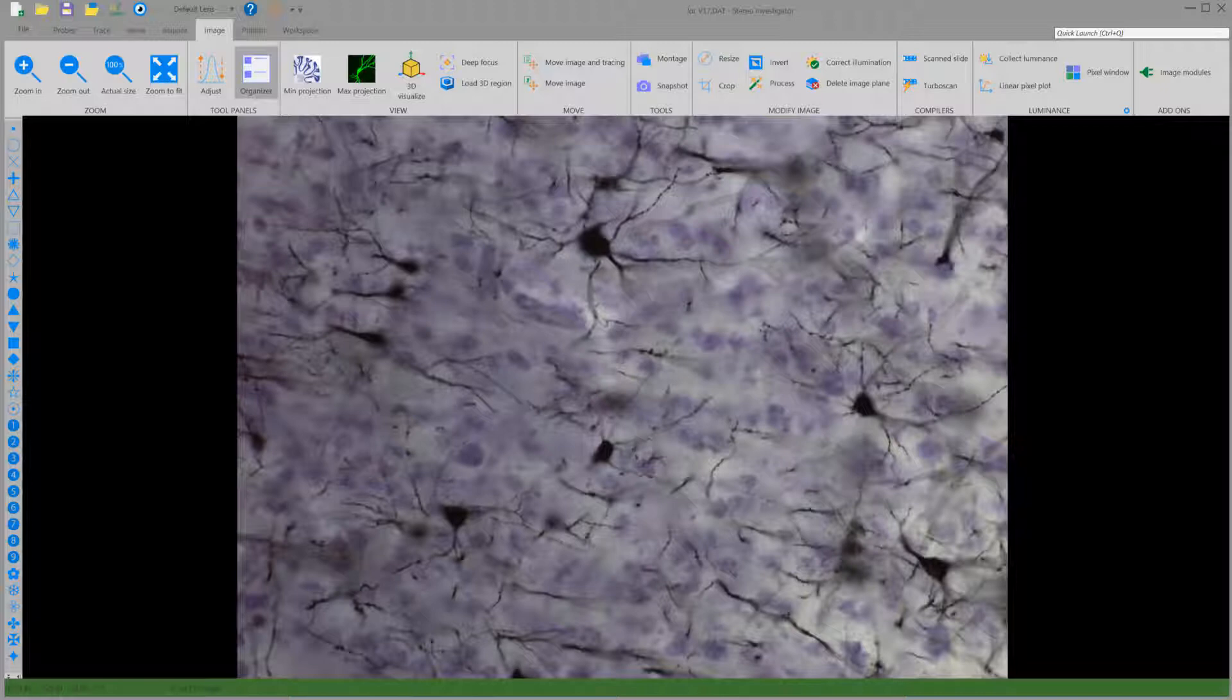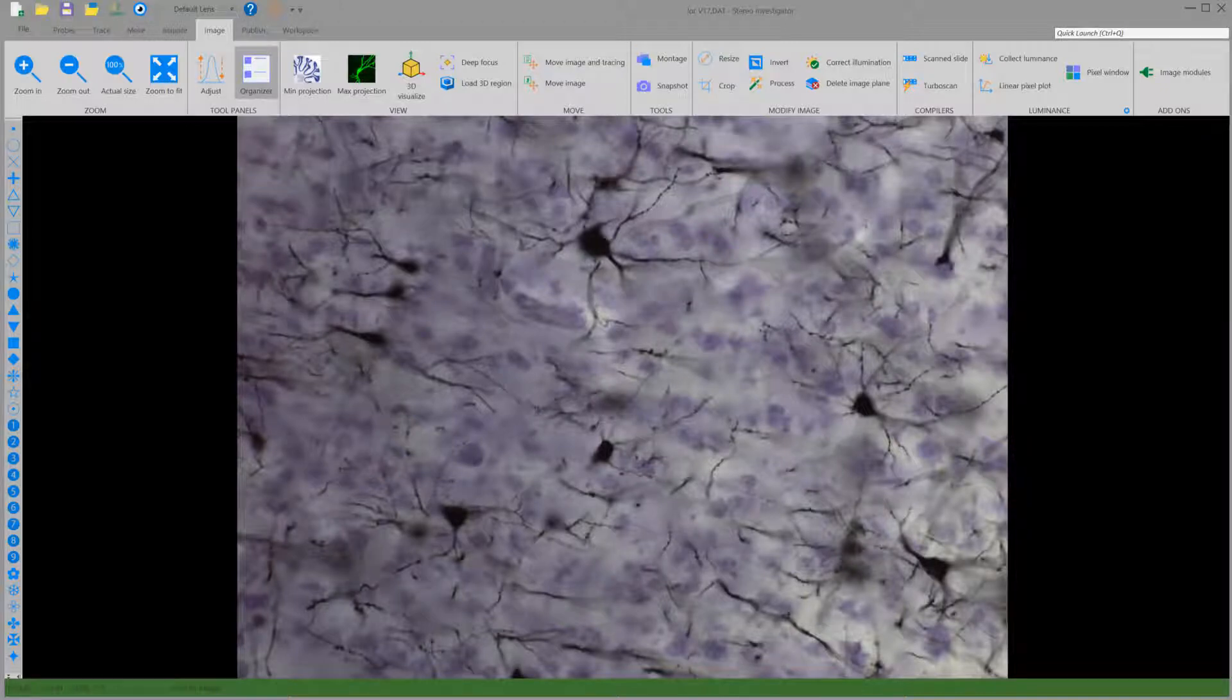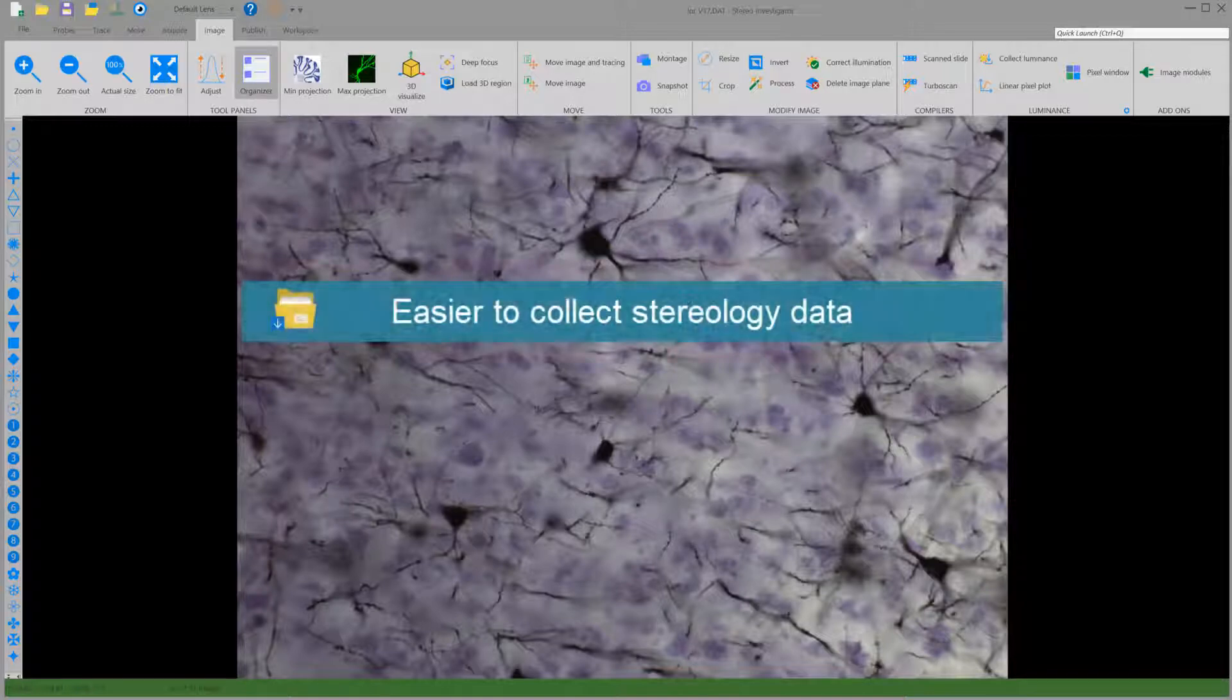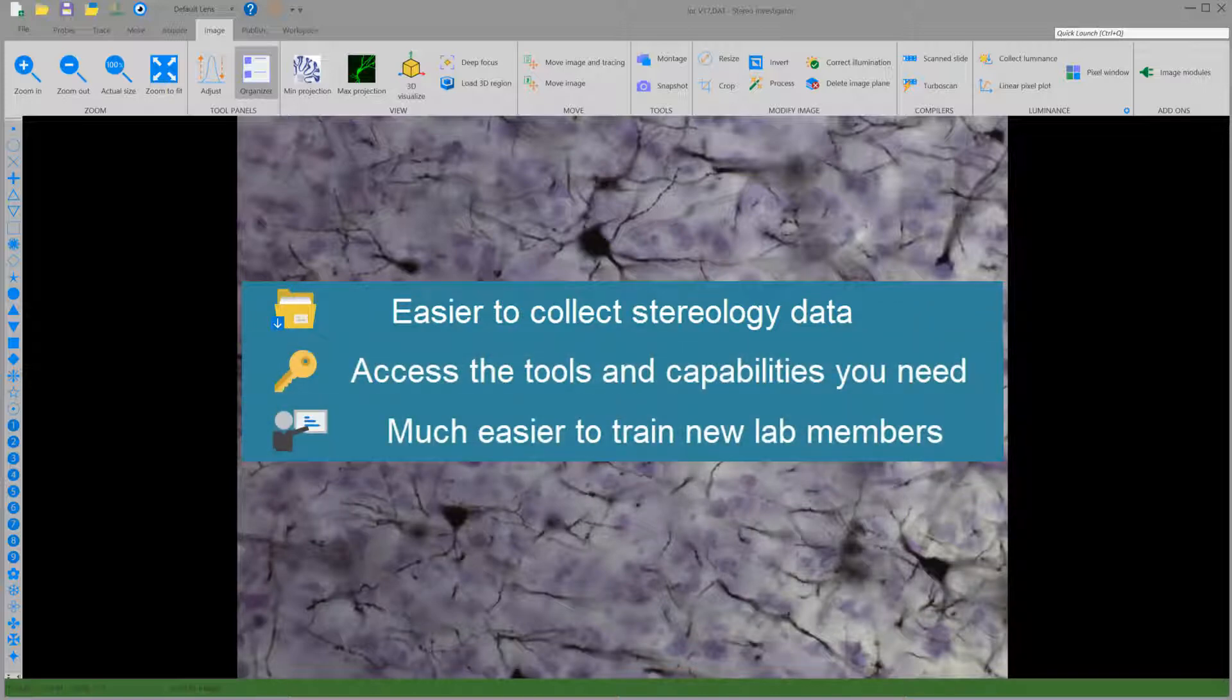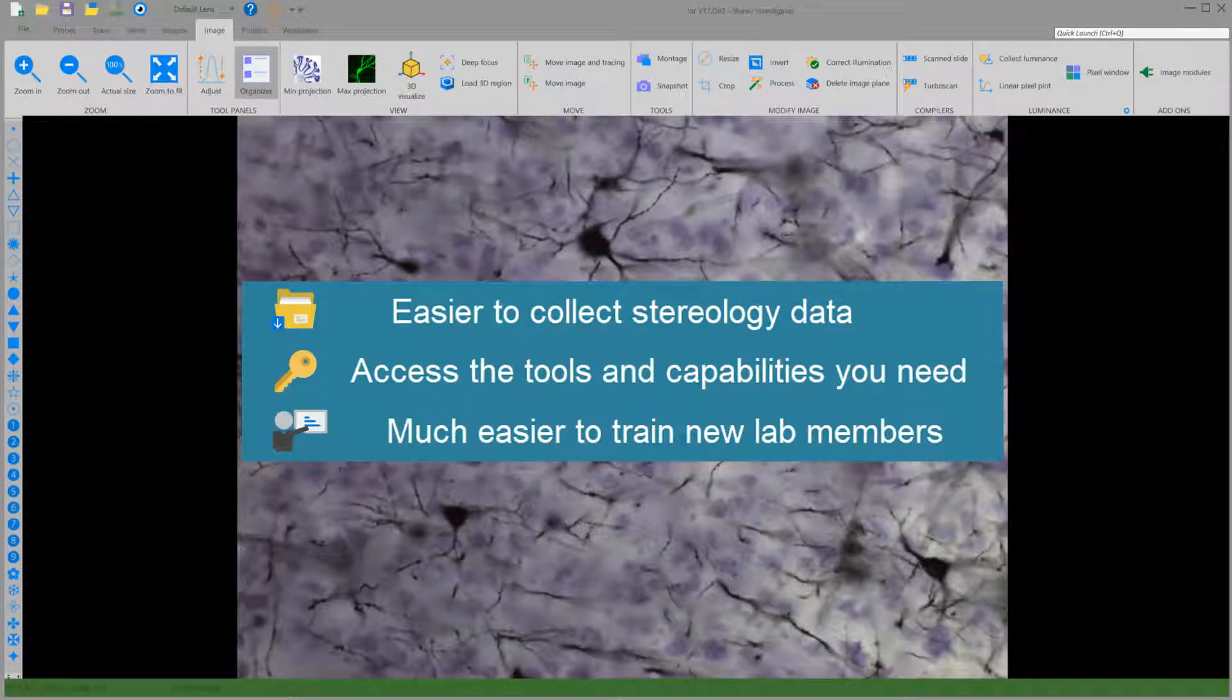These are just some of the many new features and improvements in StereoInvestigator version 2018. With the updated StereoInvestigator experience, you'll find it easier to collect stereology data, access the tools and capabilities you need, and it will be much easier to train new lab members.